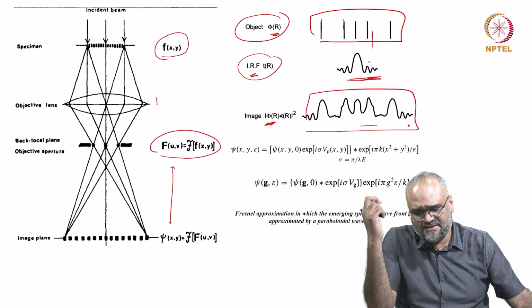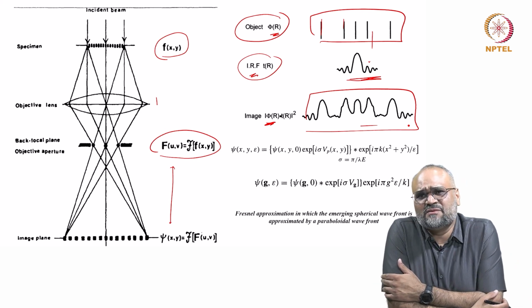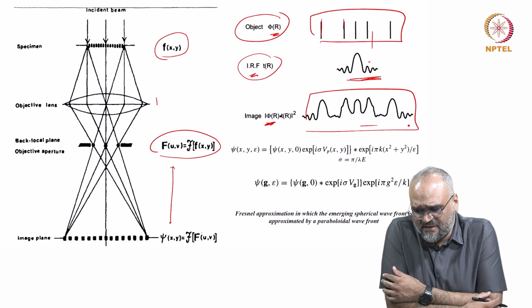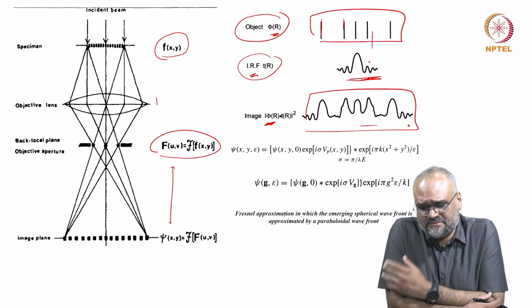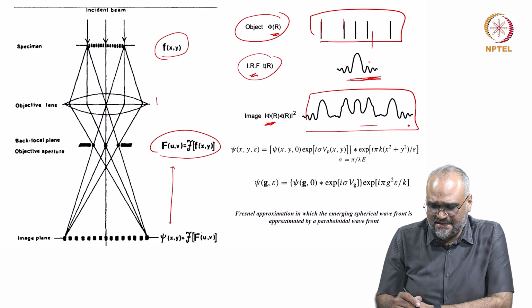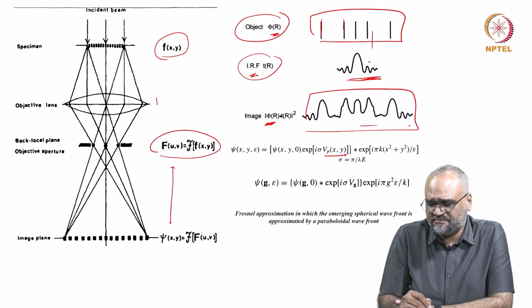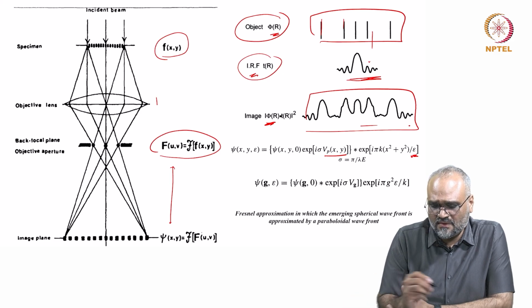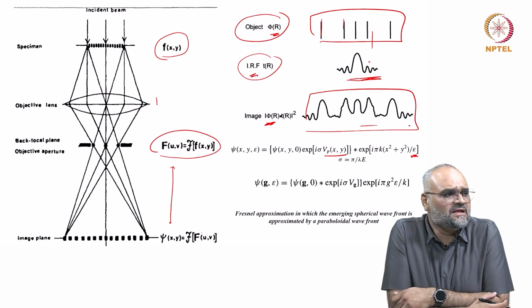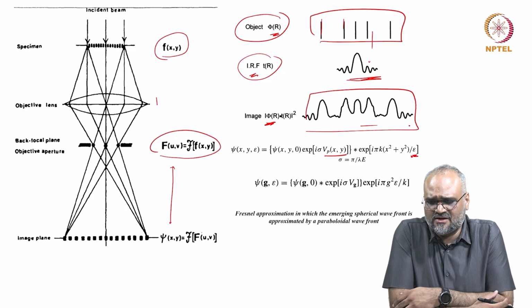So, based on this, what you can see is by using the Fresnel approximation, I didn't go into the mathematical details of this. These are given in exceptional detail in one of the texts from Harald Rose and also from Dirk van Dyck's paper. You can see that the projected potential is dependent on the electrostatic potential, the defocus that I actually introduce, and also on the aberrations of the lens. And essentially, this is what we are recording in a high resolution transmission electron micrograph.